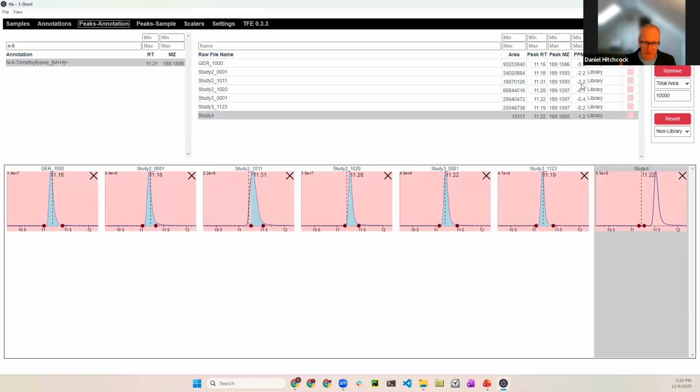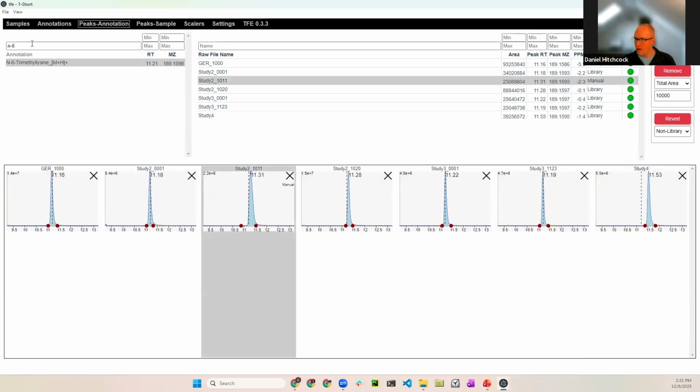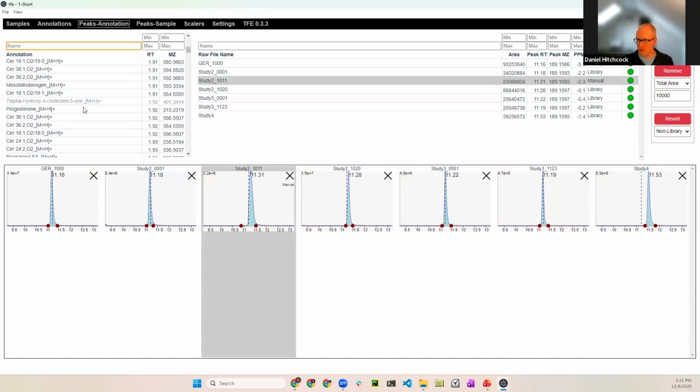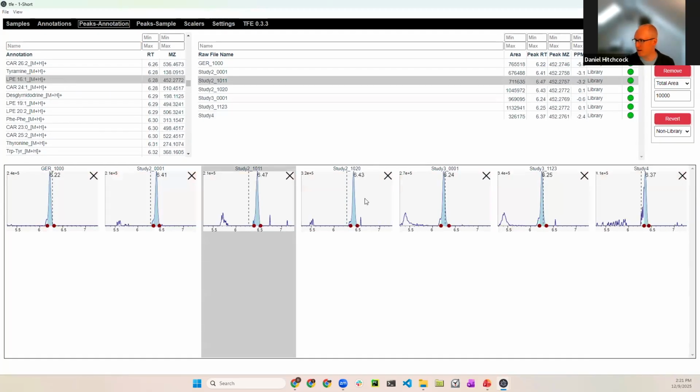And now it doesn't do it automatically because I don't want to lock people into a long process if there are 1,000 samples or thousands. And maybe I'll make this an option to automatically do it. But let's go ahead and hit re-extract, reintegrate, and there's this. So these were run at different times. You might have observed that some run early or late.